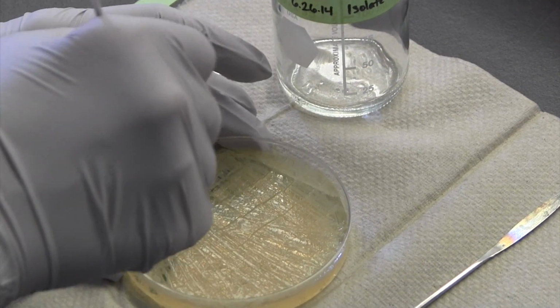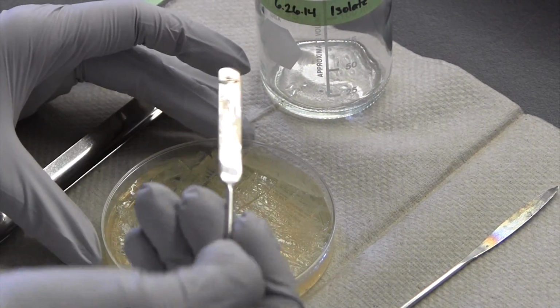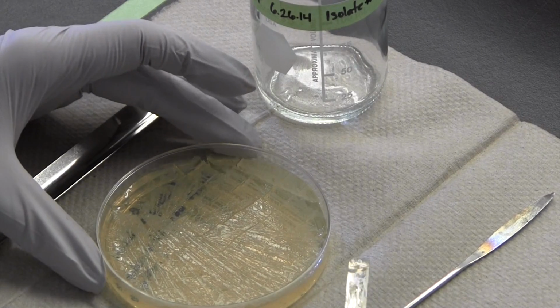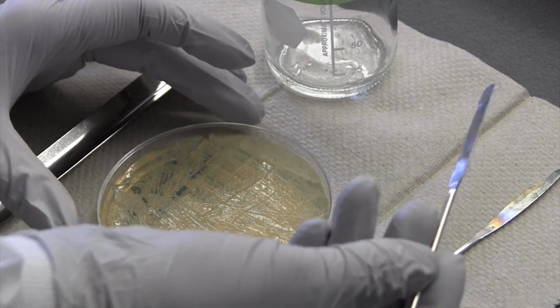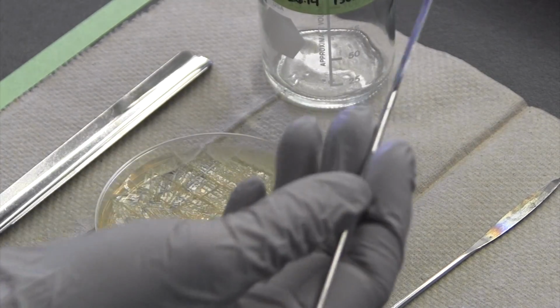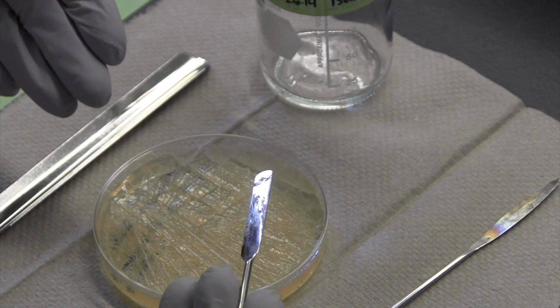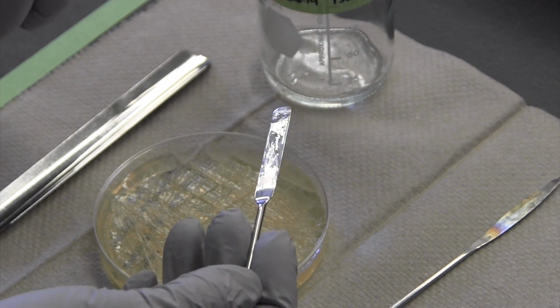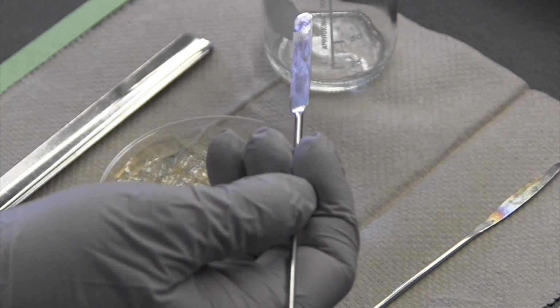Karen, is there any need to somehow, not sterilize, but sanitize the spatulas before you actually use them, or is that unnecessary? So my assumption is that these were sterile, had come out of an autoclave, were wrapped in foil before we unwrapped them. So you do want to make sure that you're working with something clean, because hopefully whatever you're extracting is just from your microbe. But all of this will basically be sprayed down and then cleaned afterwards as well.